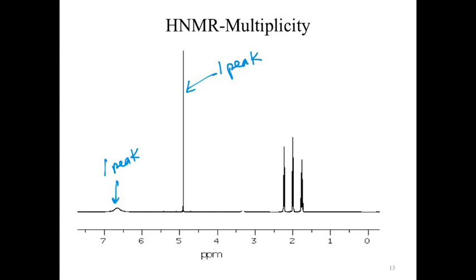If you look really carefully, and I tried to blow this up as much as possible, we actually have 1, 2, 3 peaks for that first signal. For the next one, I'll switch up the color. 1, 2, again, 3 peaks for the second one. And for that last one, we've got 1, 2, 3, 4, 5 peaks. Yeah, I know, obvious, right?